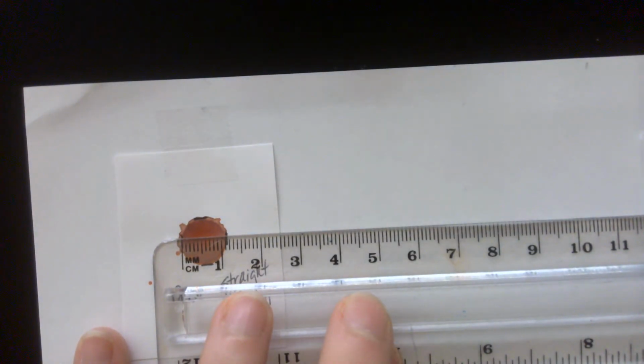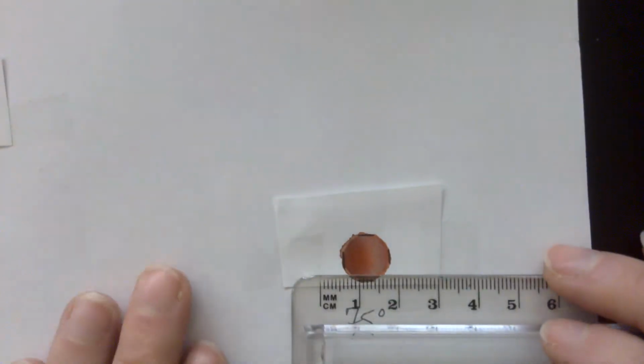Okay, so there's your width for 90 degrees. There's your length. And you can pause the video as we go so that you can read the ruler. Remember, you're measuring millimeters as the smallest line. So 1 centimeter has 10 millimeters in it. Okay, I think 75 degrees is next on your data table. So we'll go down to that one.